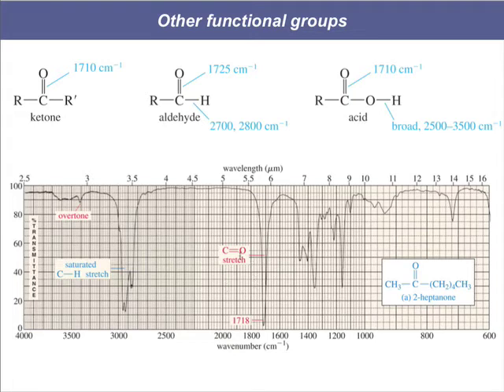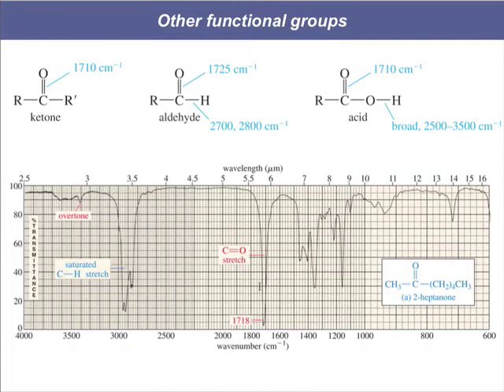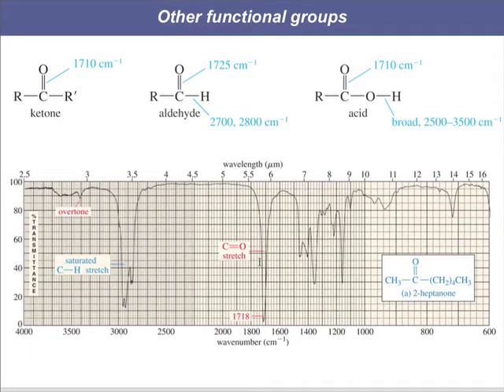So where we would see 1718, we see overtones at around 3400, the multiple of that. So sometimes you'll see these overtones. They can be ignored. If you say that looks really weird, think about the fact that there might be something else causing that vibration. Basically, these carbonyls are causing other bonds to vibrate at multiples of their frequencies.